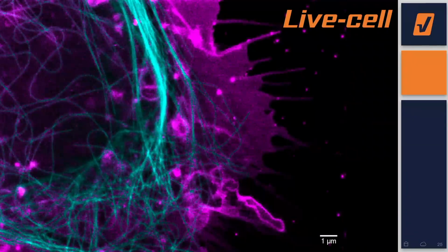Both are in the red spectra, and you can see here an example. So that's HeLa cells, and tubulin is stained with Live 610, and the membrane is stained with DID, and we can nicely see here the edge of the membrane. That's the confocal image with our TIMEBOW, so we cannot separate these 2 channels. But if I did a STED image with TIMEBOW right now, we can easily separate them, show tubulin in cyan here and the membrane in magenta. And also we see a really nice STED effect right now here.